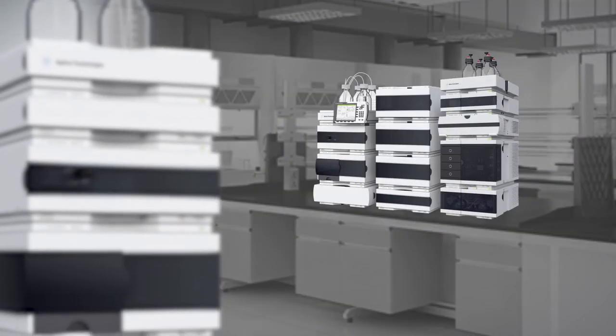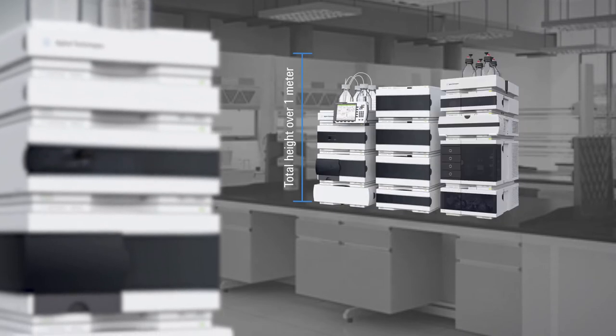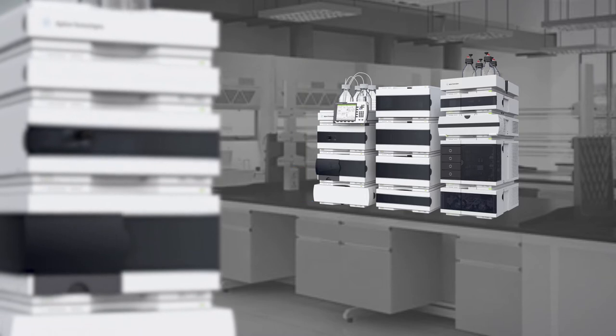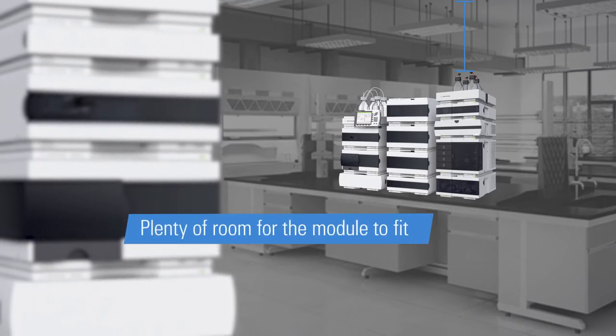Depending on your stacking configuration, your unit's total height could be over 1 meter. Plus you'll need to leave ample space for your solvents. We'll talk more about the stacking configurations a little later, but for now make sure your preferred location for the module allows plenty of room for the module to fit at its tallest.